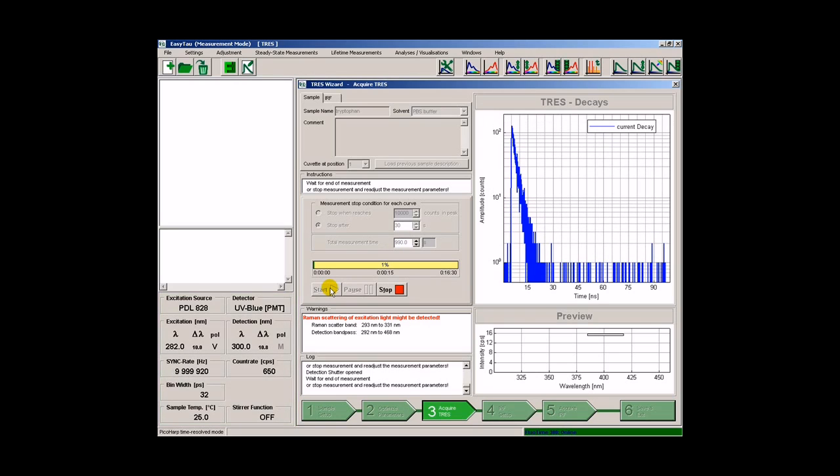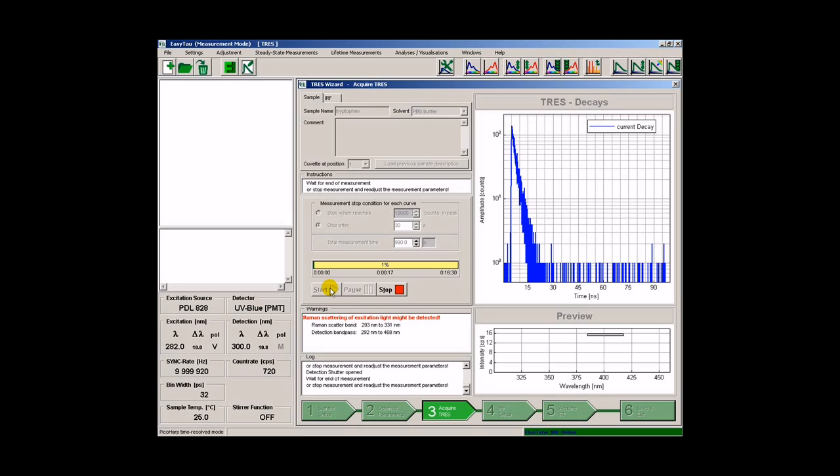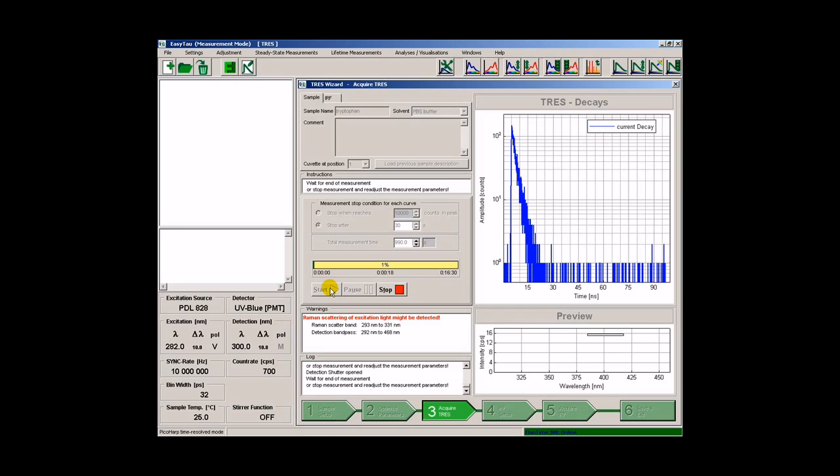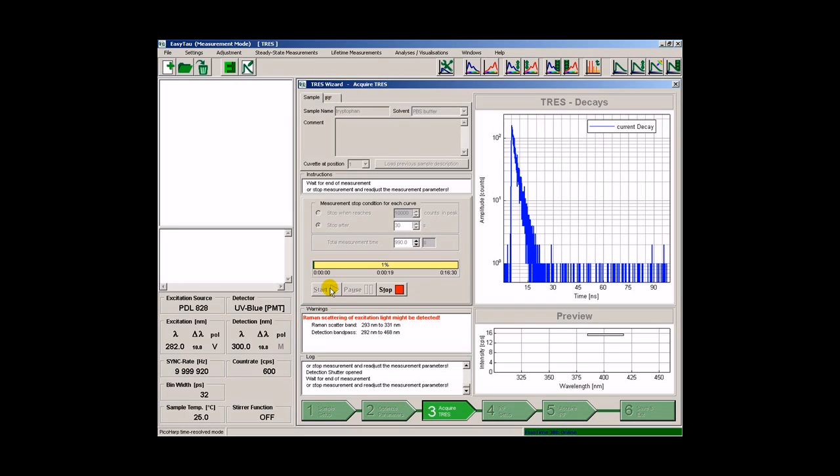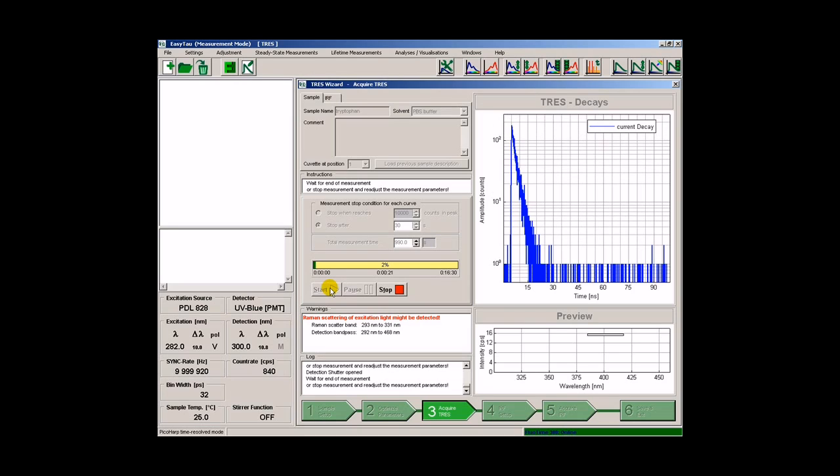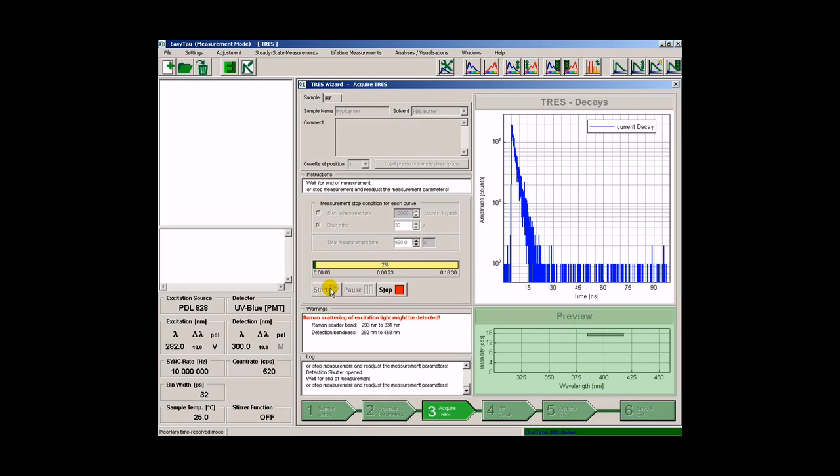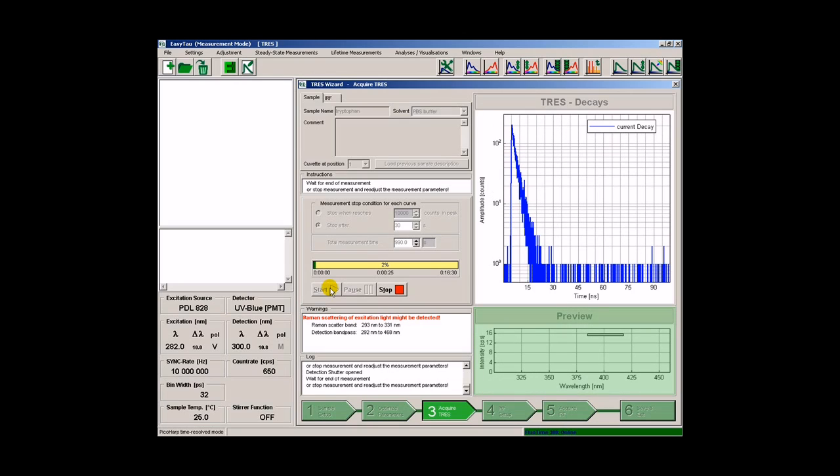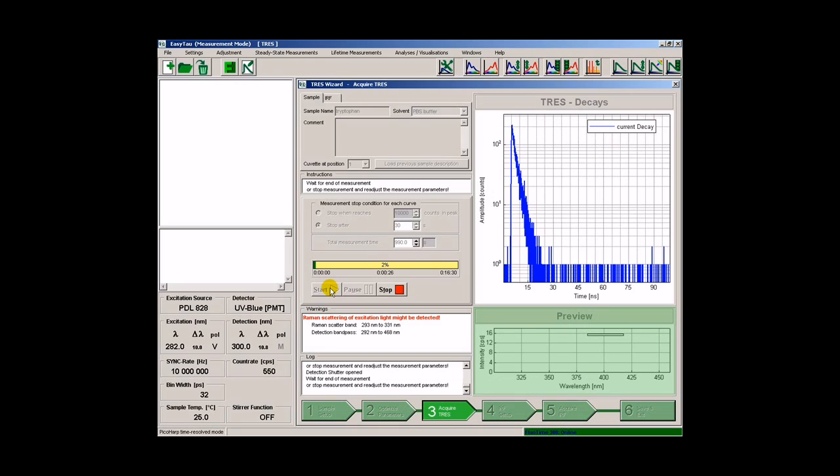For comparison, the most intense and the least intense decay is shown together with the decay being acquired at the moment. The bottom panel shows the emission spectrum as we proceed through the wavelength range selected previously.